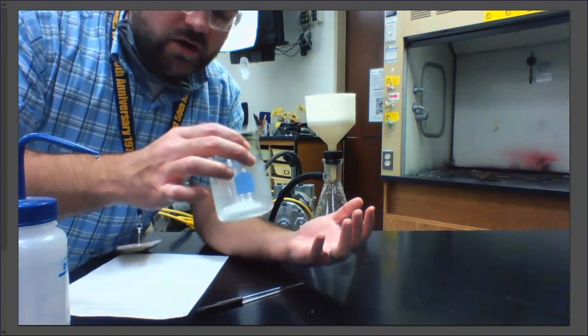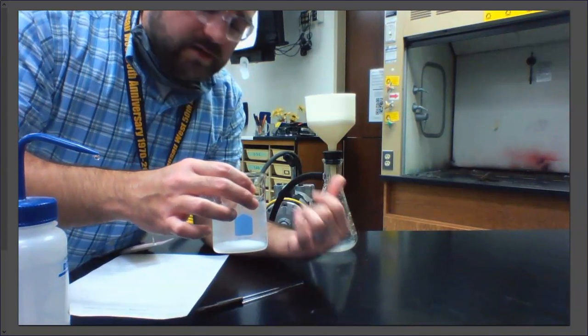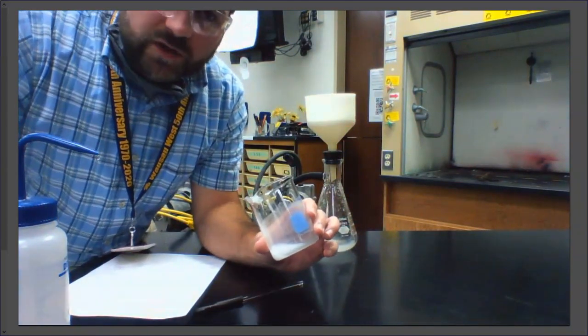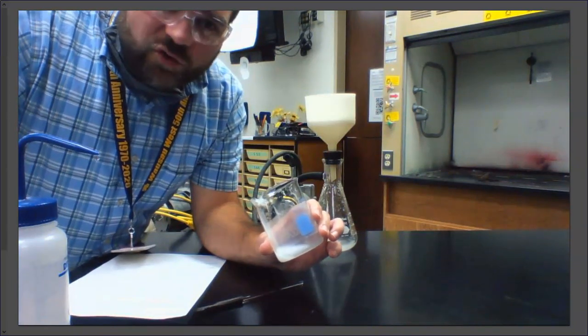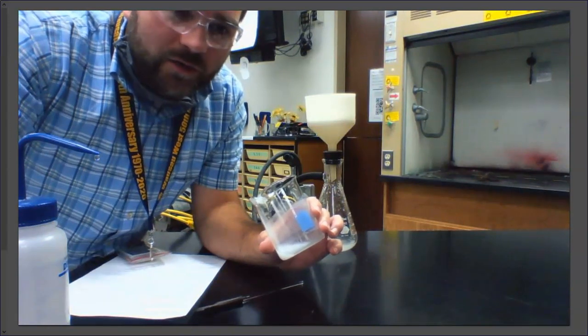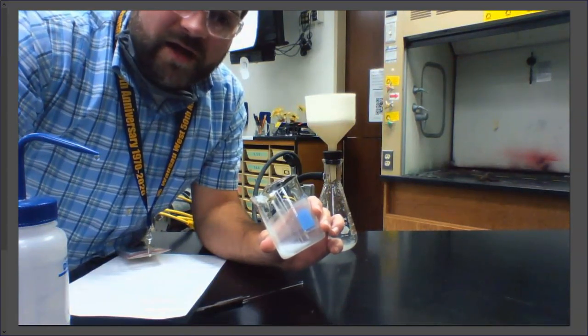So I use the distilled water, I rinse, I pour it in, I rinse, I pour it in, and I try to transfer as completely as I possibly can. This is called a quantitative transfer, all right? We're transferring every last little bit of our sample. So I'm going to do that right now. Again, I'll come back in just a second.